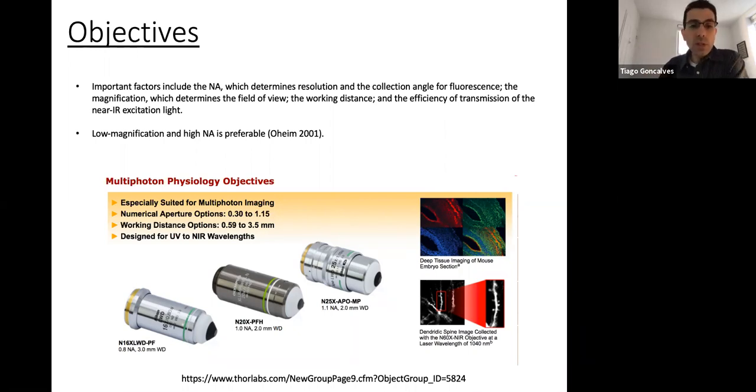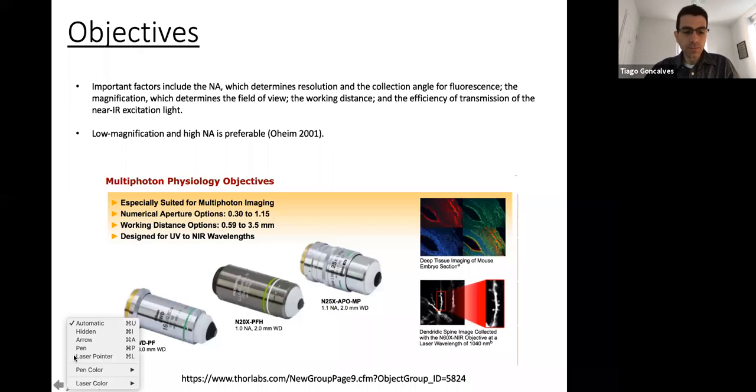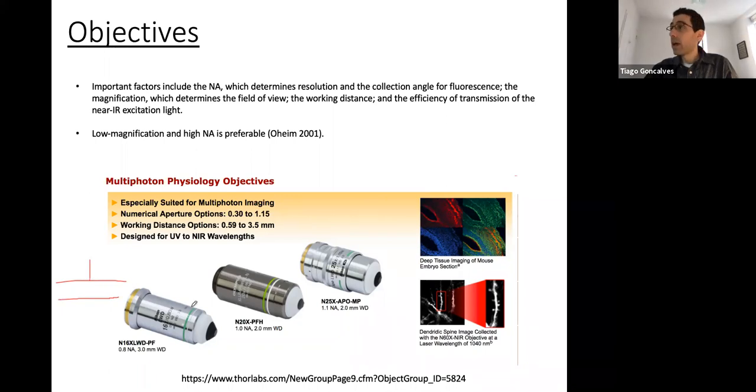And now there are all of these specialty objectives. One important point is that your objective has this back window. I should have made this a little bit clearer, but your focal point will be the Fourier transform of whatever you put in. And you know that in simple single dimensional space, the Fourier transform of a single point, the Dirac delta function, is a flat line, right?